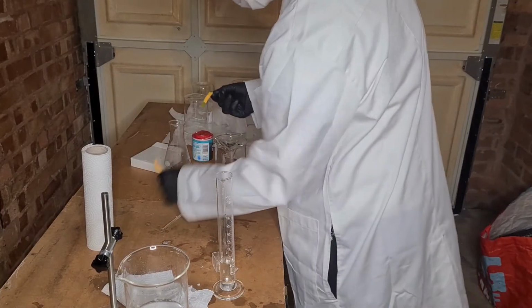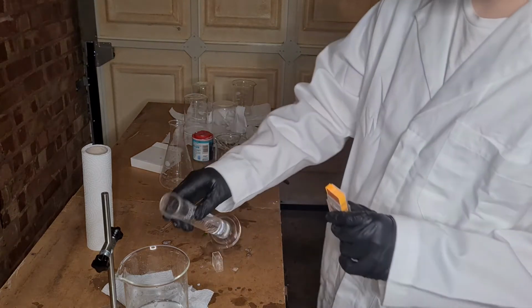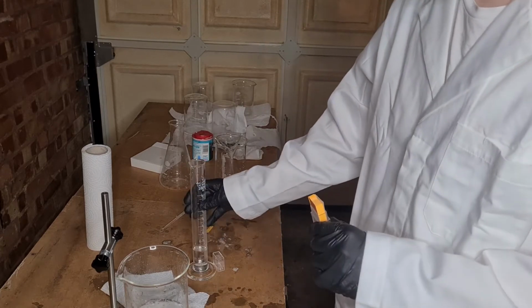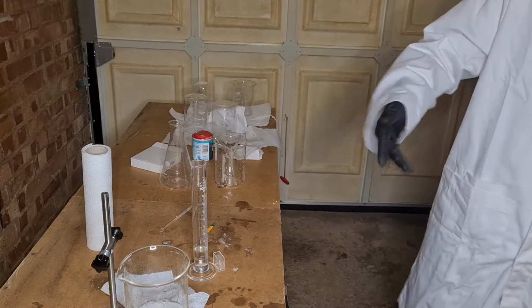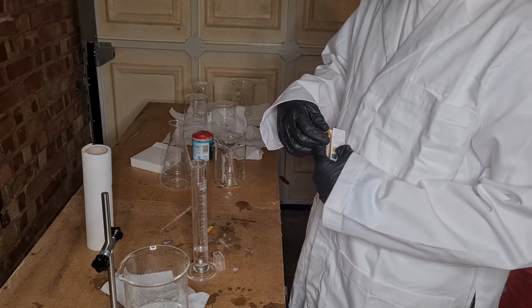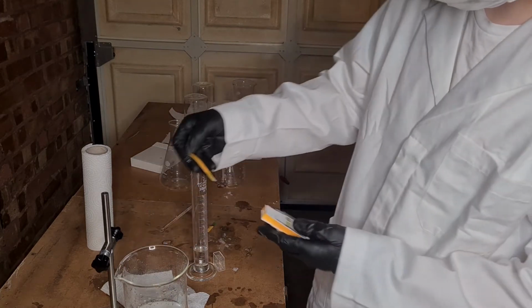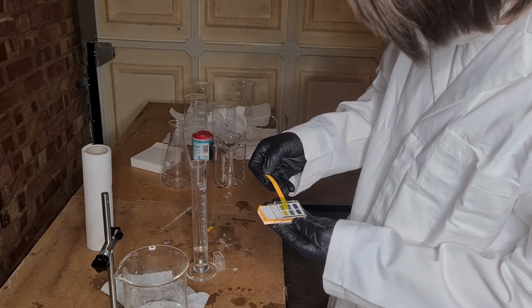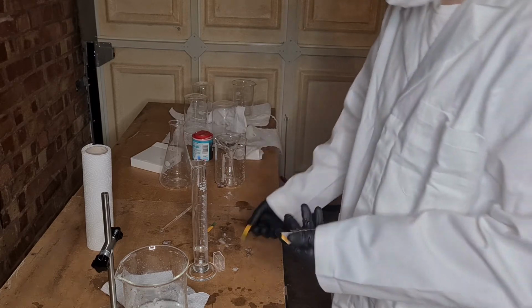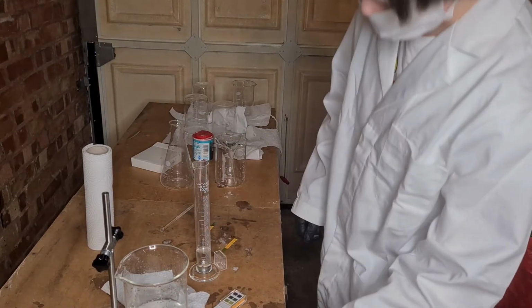So we're getting to a pH, we're still around 8, which is not what we need right now. We need a pH of 7. So this does bubble like crazy, all the CO2 gas. If you touch the beaker, it should be warm to the touch. And we are at a pH of around 7. So that should all be reacted. However, as I'm not entirely sure whether that's really from stirring, I turn it down.